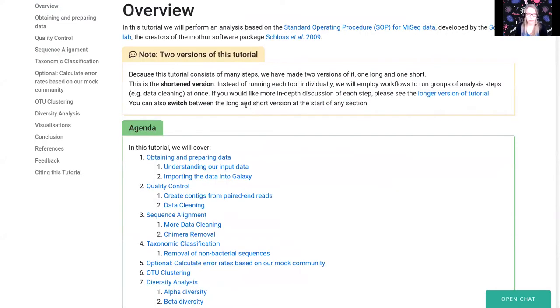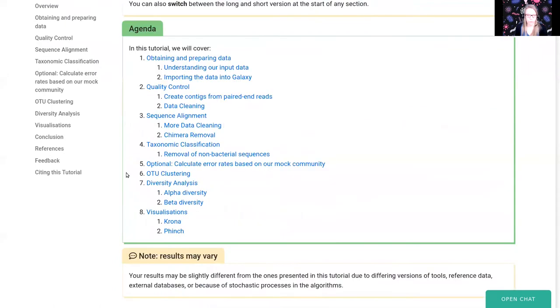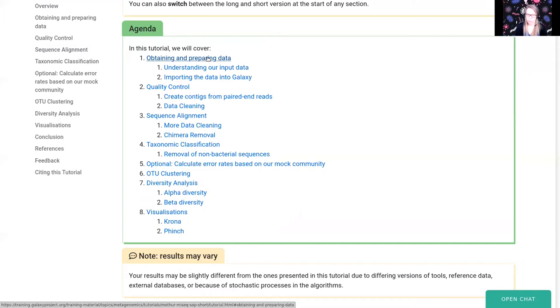In this tutorial we will follow the standard operating procedure (SOP) for MiSeq data as developed by the creators of the Mothur tool package and the Schlosslab. The Mothur tool package is the analysis tool we will use. First we will get our data into Galaxy, and because we have multiple samples, we will create a collection so we don't have to run every tool for every input dataset — we only have to run the tool or workflow once for the entire sample set.